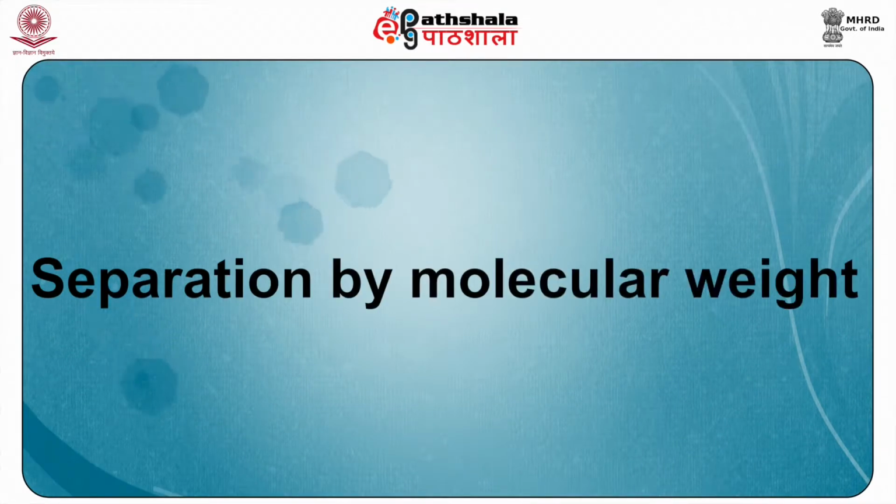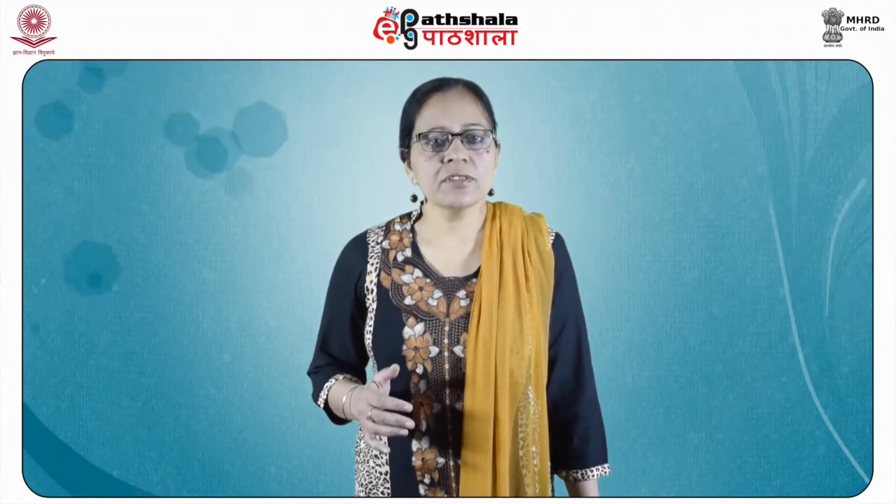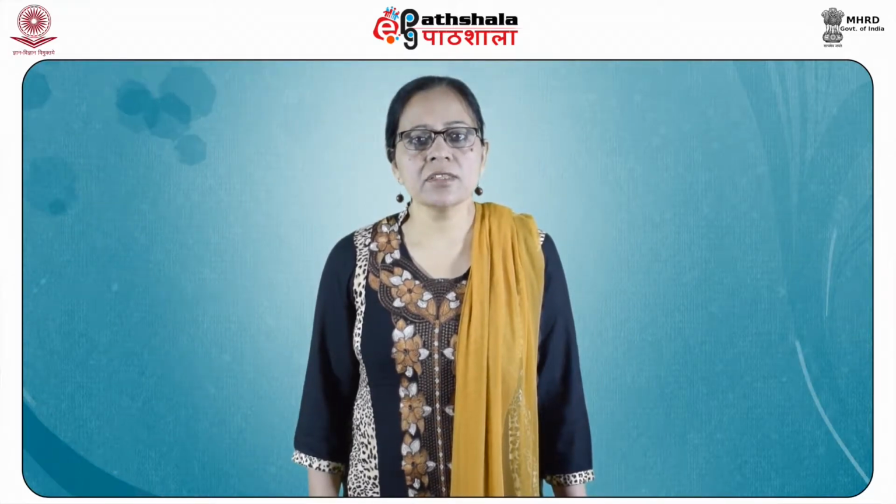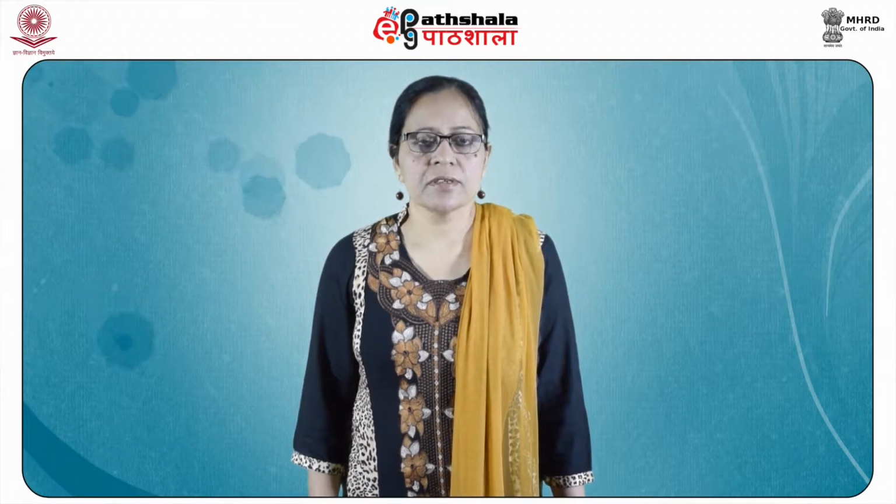Separation by molecular weight. Electrophoresis is widely used to separate proteins on the basis of their molecular weights. Functions of proteins can be determined by using native or non-denaturing electrophoresis. But sometimes some proteins are not separated by this electrophoresis and require denaturing of proteins. Separation after denaturing is known as denaturing protein electrophoresis.